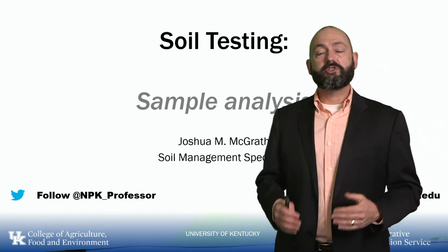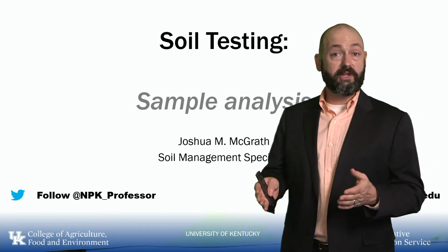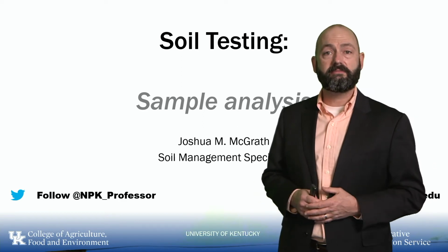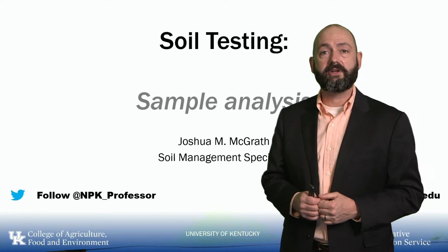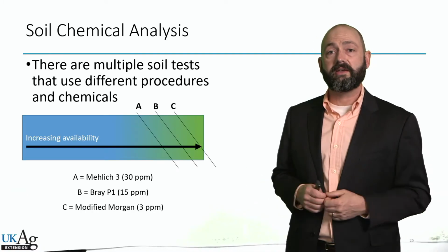In this presentation, we're going to talk about soil analysis. It's one of the steps in soil testing. The 4 steps of soil testing are soil sample collection, analysis, interpretation, and making recommendations. So soil sample analysis is basically a chemical analysis.